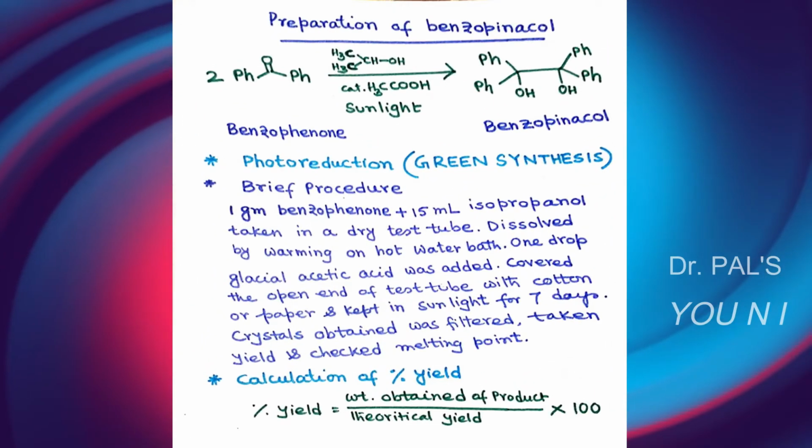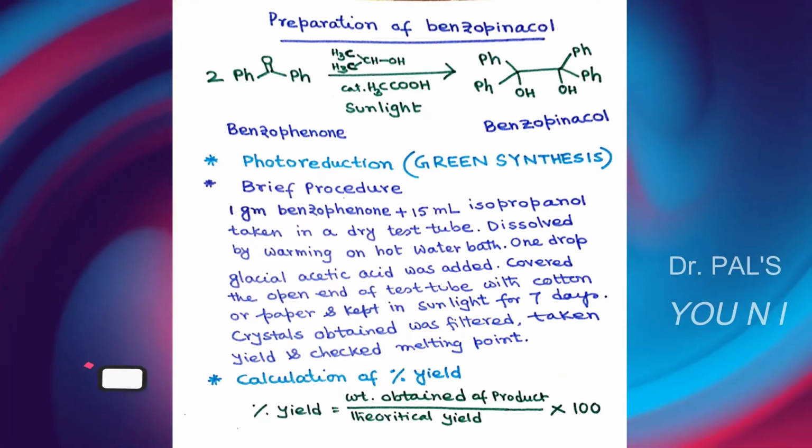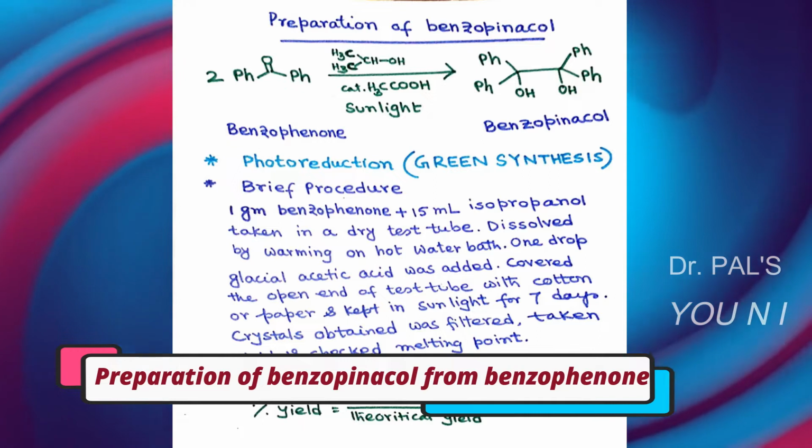My dear students, I welcome you all to today's topic, preparation of benzopinacol from benzophenone.